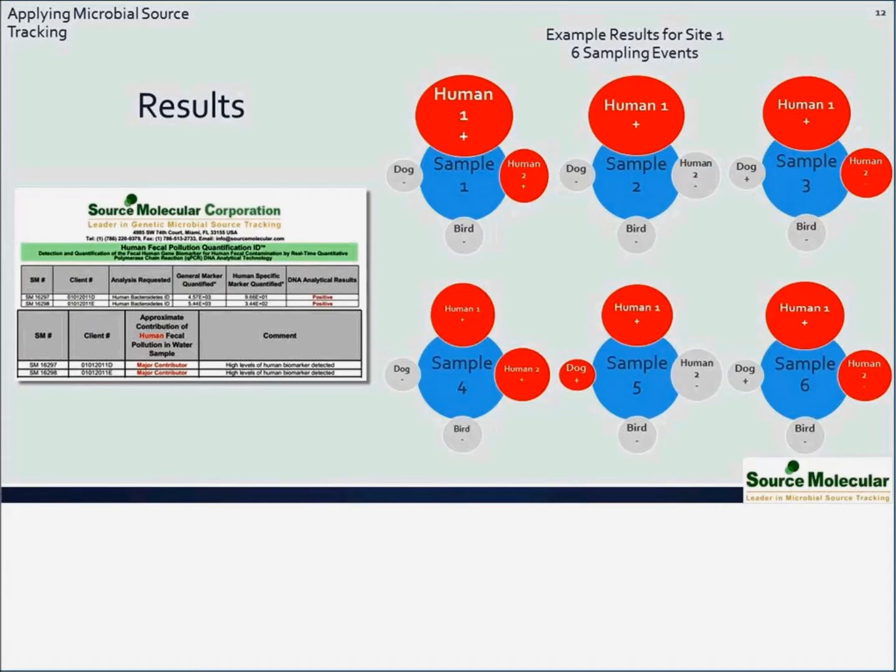But what it's going to tell you is that in this case, you probably have a human problem. I'm emphasizing this because a common misunderstanding is that people expect the original pie chart idea from over 10 years ago, which never really worked out. But what is working is this form of interpretation of data.